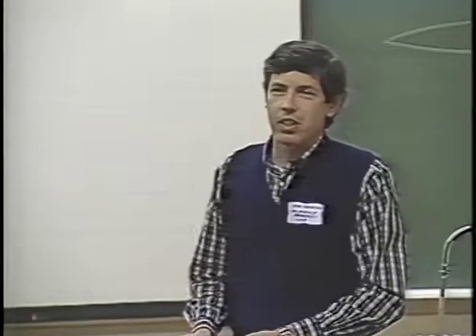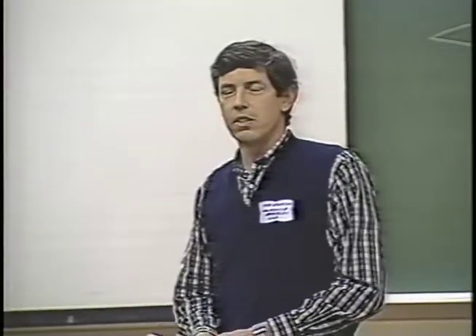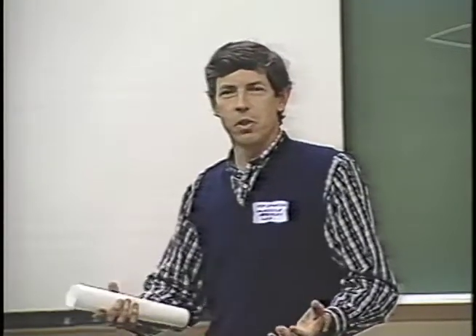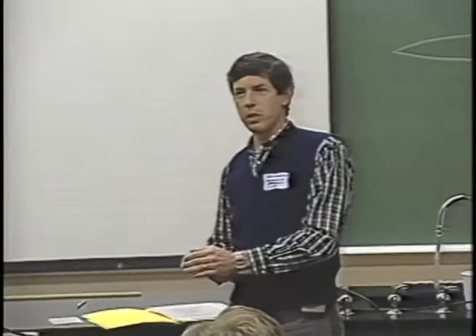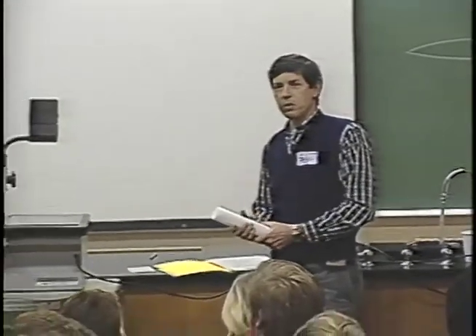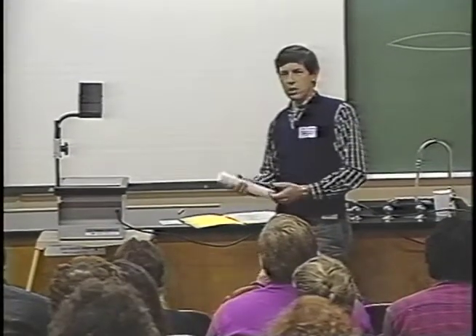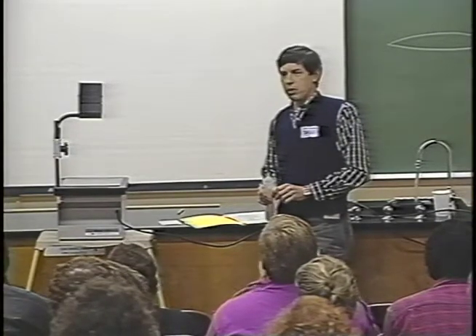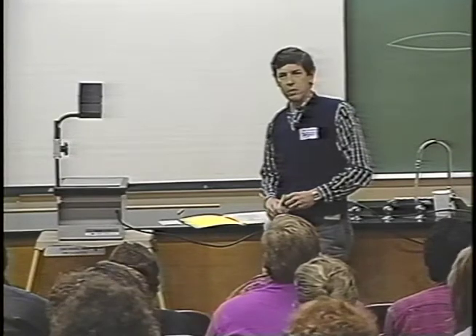What I wanted to do is briefly review the reasons why people use high voltage microscopy. I'm sure you all know why you're here, why you're interested in the high voltage aspects of microscopy. I suppose for most of you it has to do with the ability to look through thicker specimens than you can look at with a conventional microscope. And indeed, that's probably the primary driving force for the development and application of the microscopes.